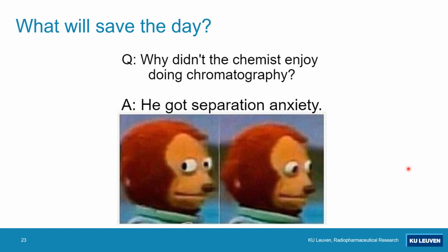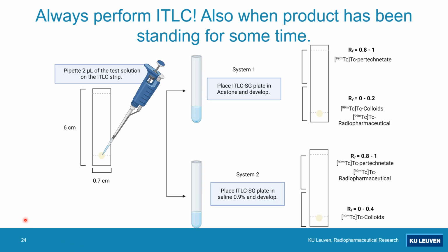So what will save the day? Definitely, if you do instant thin layer chromatography, you sometimes get separation anxiety waiting for the results, especially if you had problems before. But instant thin layer chromatography will save you from problems. So I cannot say enough how instant thin layer chromatography is your friend.